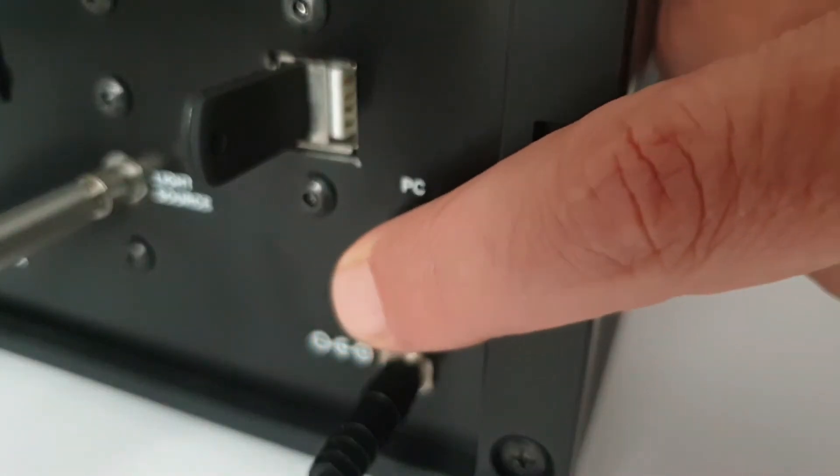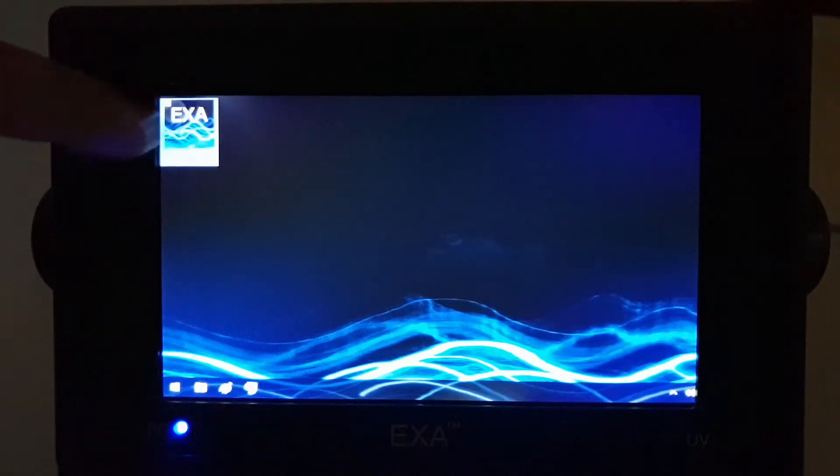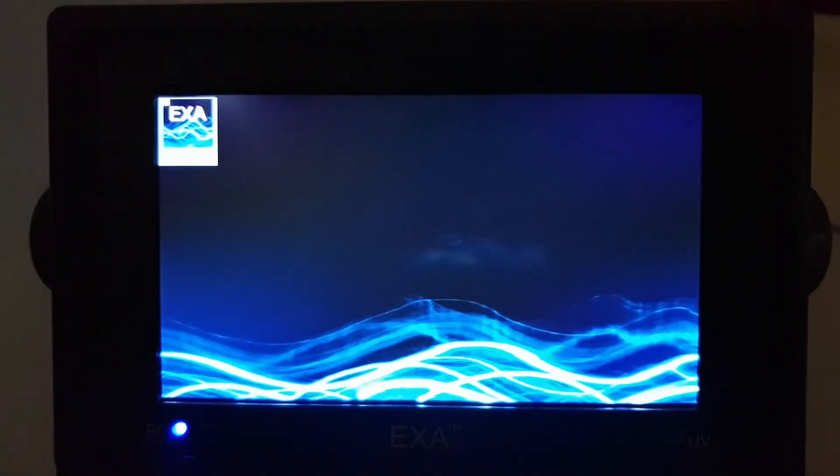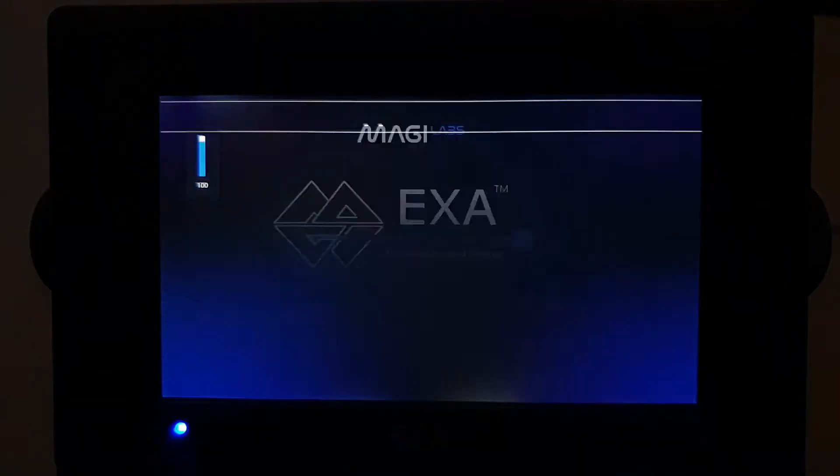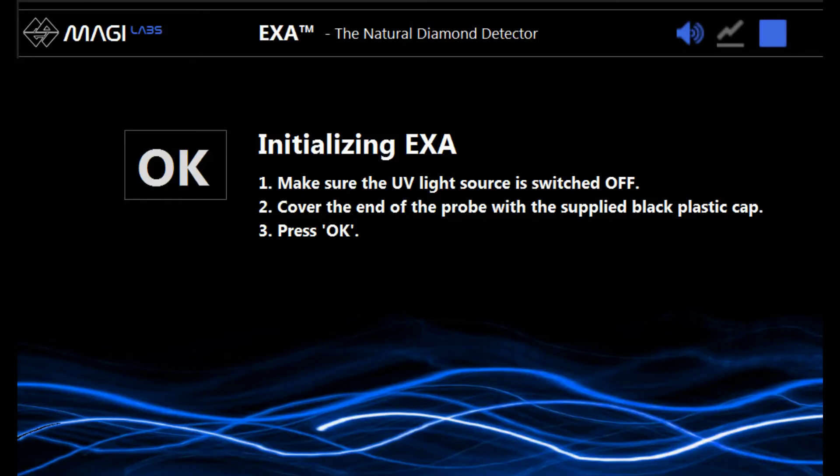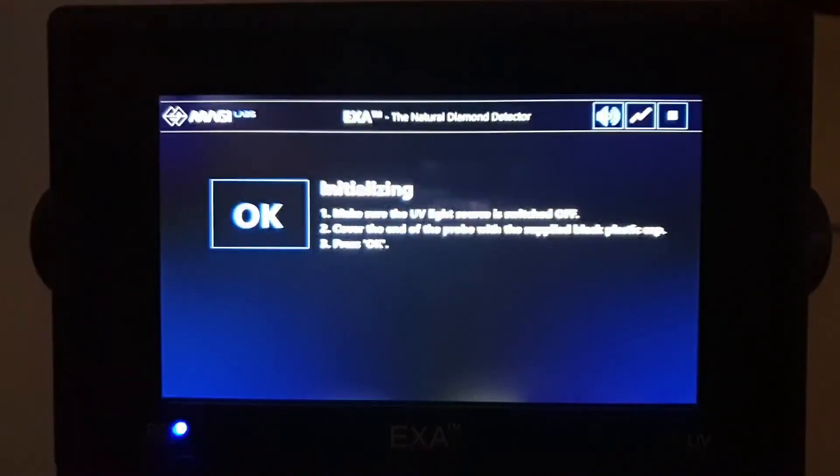Press the ON-OFF button on the rear panel of the EXA. Click on the EXA icon on the screen. Make sure the UV light is off, cover the end of the probe with the supplied plastic cup and press OK.